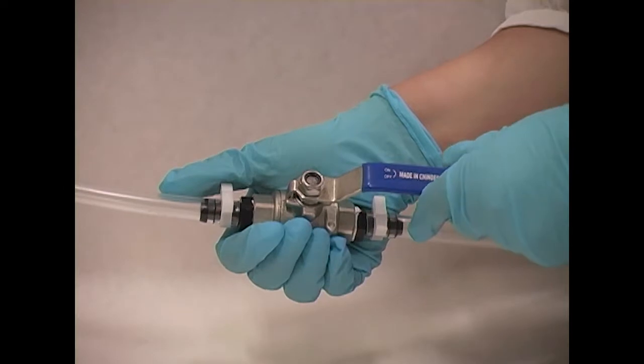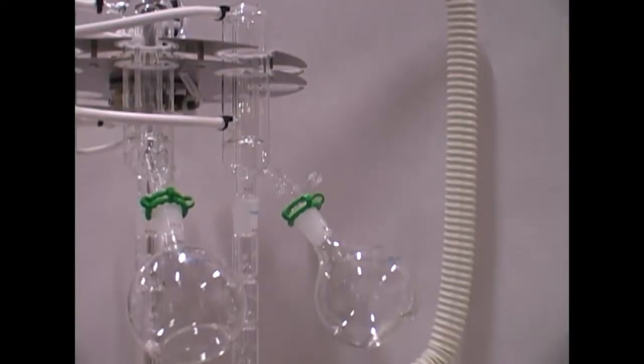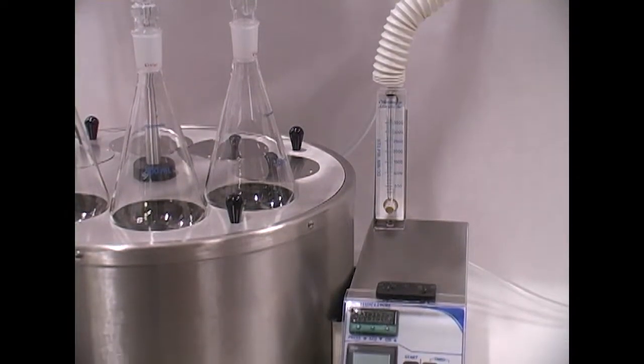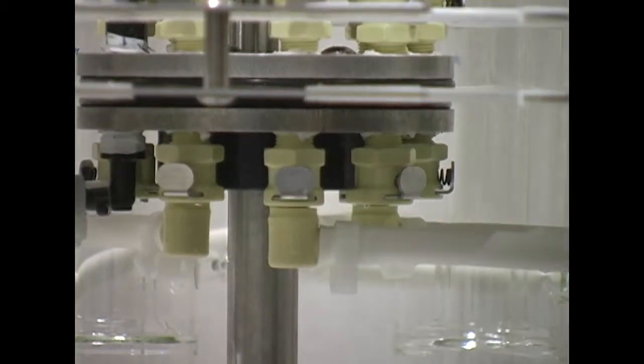The instrument comes with a control valve to adjust the flow of water to the condensers. One water supply line reduces the number of connections needed to the recirculating chiller or cold tap water. Water is then evenly dispersed to each condenser through the hand-built manifold.